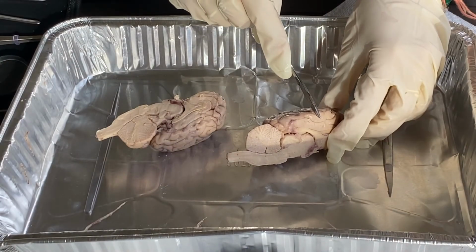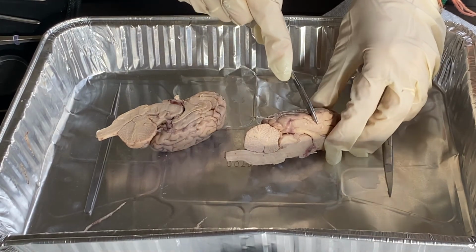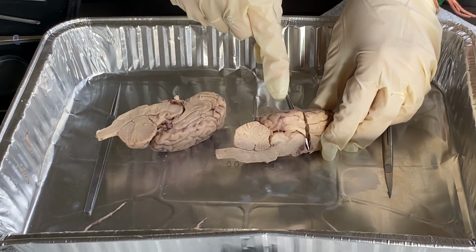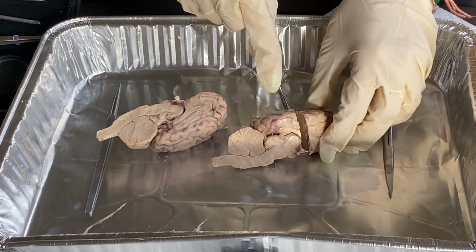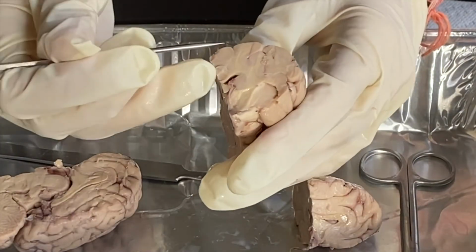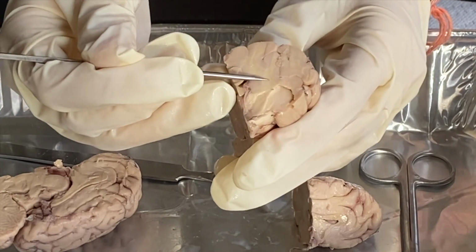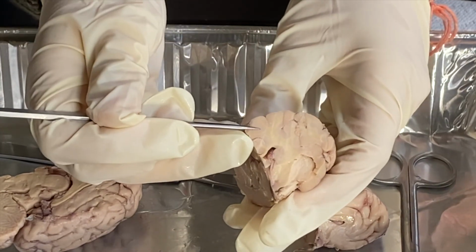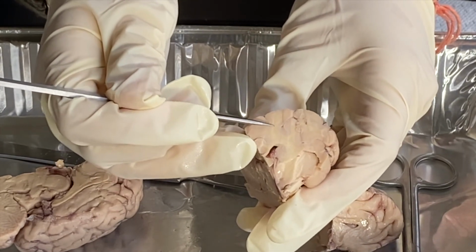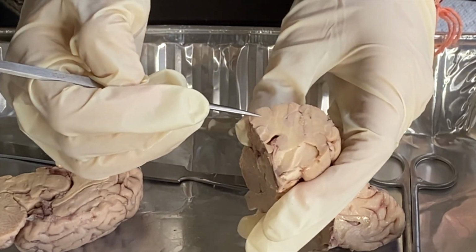So now I'm going to dissect anterior, in front of the thalamus, and try to identify the white and gray matter. So here and here, we can see the white matter. And then we can see the gray matter that's surrounding the white matter. The white matter is basically the myelinated axons, and the gray matter consists of the cell bodies.